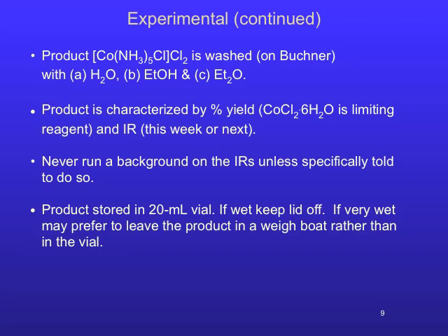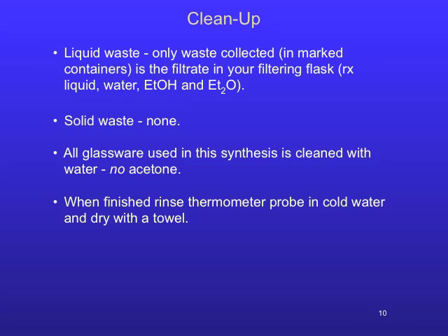When storing your product for the next lab period, if it still appears slightly wet, do not attach the cap to the vial. For a product that is very wet, it should be allowed to air dry in a weigh boat. The only waste collected is the filtrate from your filtering flask.